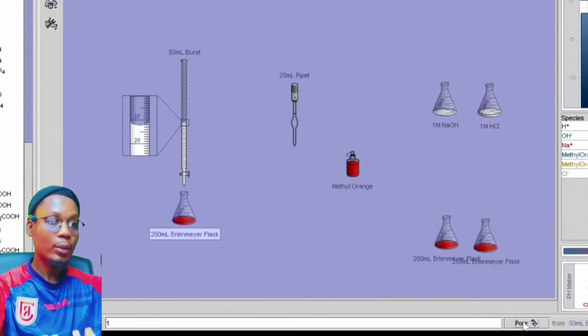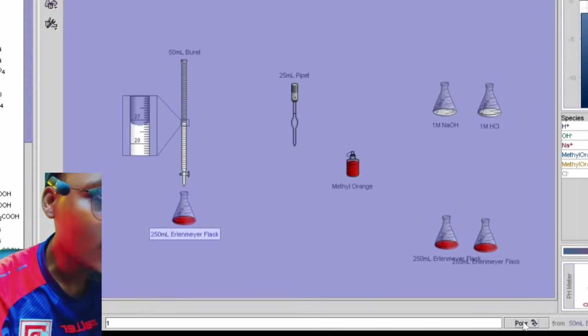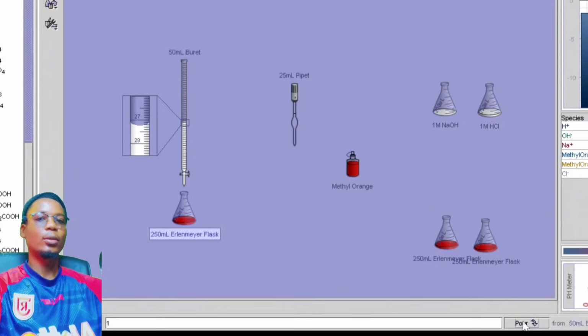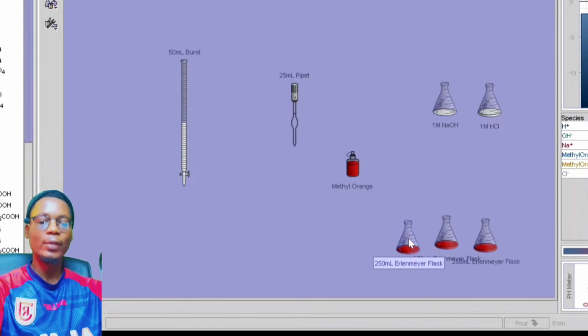Good. So what I have here is, I'd like to see this clearly. So what I have here is 27.20. So I have 27.10, 27.20, and 26.50.